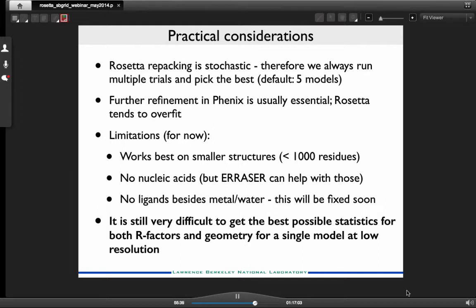That's a good question. I don't know. I will ask Frank. They have features for symmetric modeling, but I'm not sure if that's implemented as constraints or restraints. And we're only just implementing constraints in Phenix now. So I think it probably would require more coding before that would actually be possible. And it can't apply just to a portion of the model, even a smaller portion of the model using NCS? No. Okay. You still have a combinatorial problem.